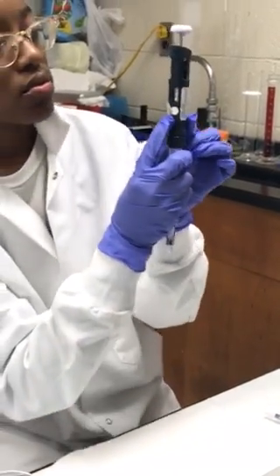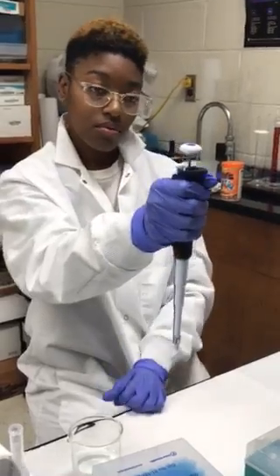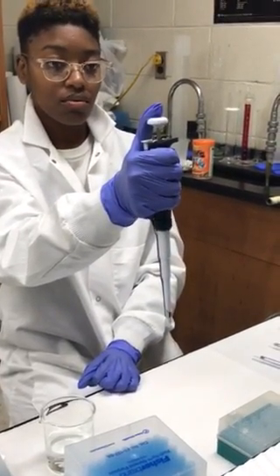When holding the pipette, you should hold it where the volume indicator is facing away from you. Keep in mind, your thumb should be lined up with the plunger button and tip ejector.